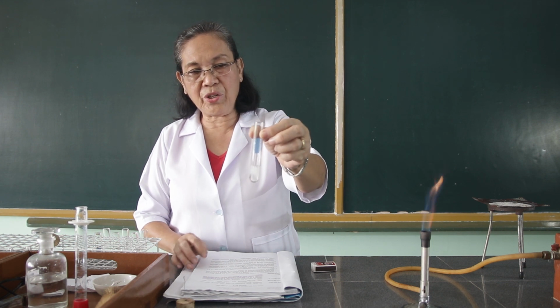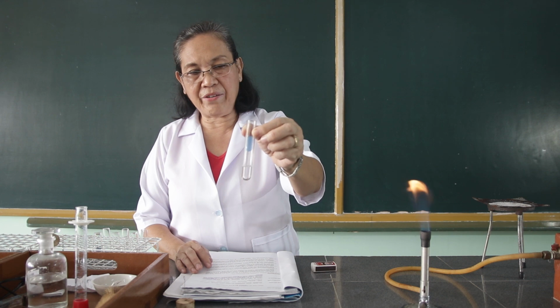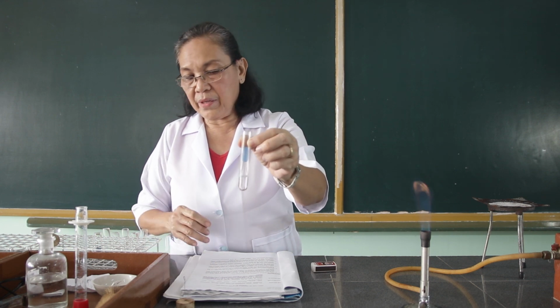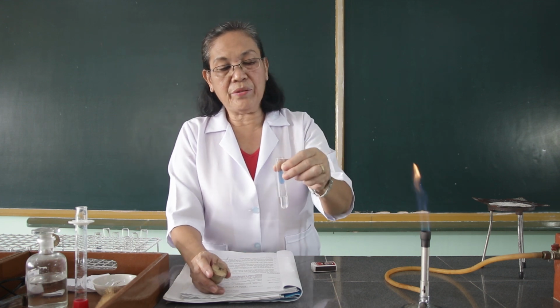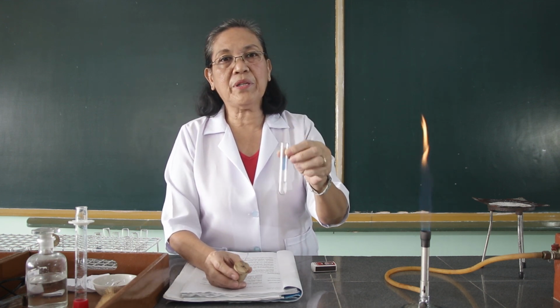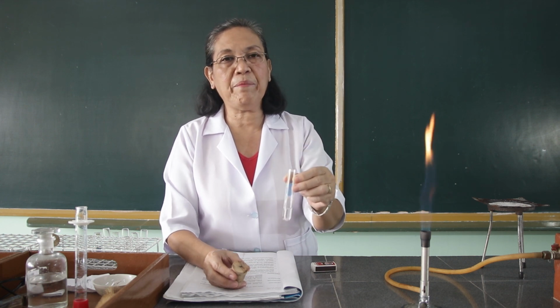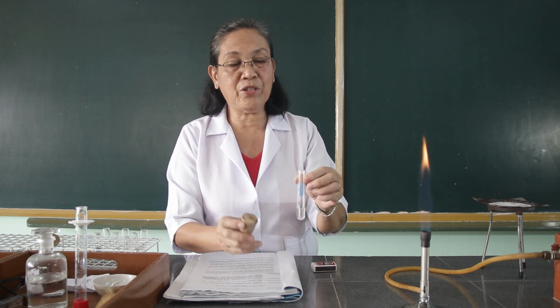So this is the mixture of the potassium carbonate, the water, and the hydrochloric acid. To this mixture, we're going to test the presence of potassium. I want you to observe what is the color of the flame imparted by the Nichrome wire when we place it onto the Bunsen flame.